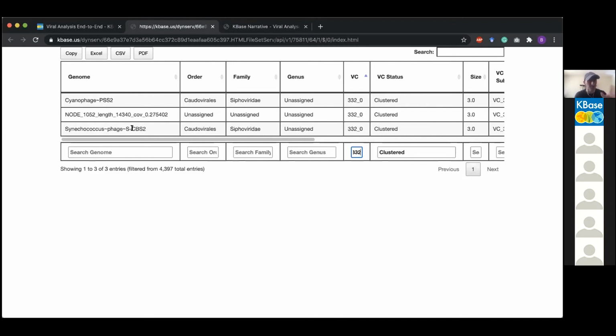I probably should have put them in here, but you can Google Scholar them if you'd like, PSS2 and SCBS2. They are often found to be in the same cluster or the same groupings. They align and follow genetic trees closely, almost always adjacent to each other, unless there are other novel members in them.